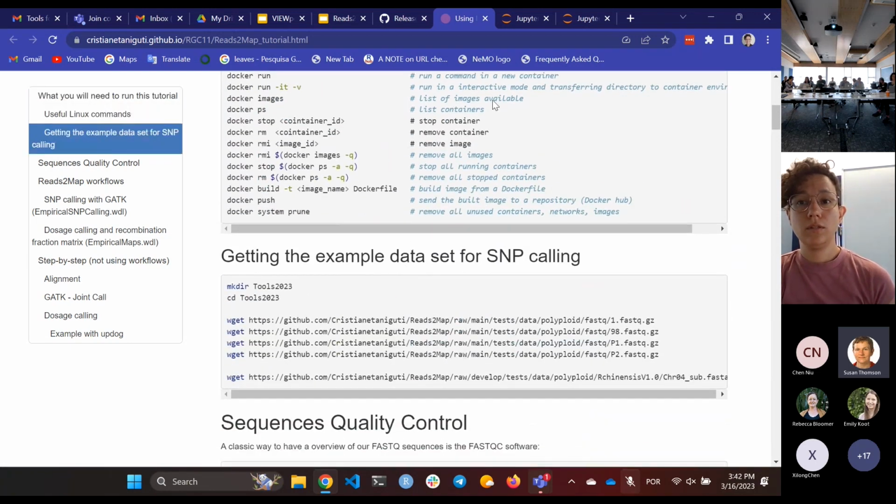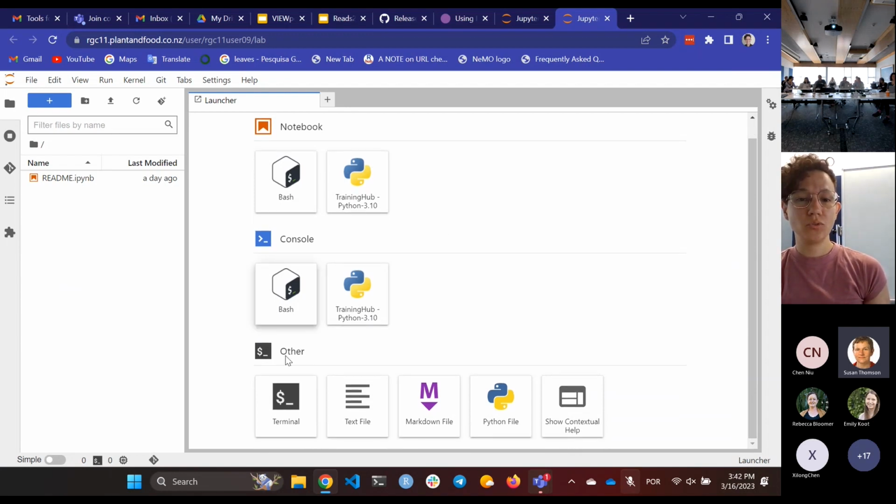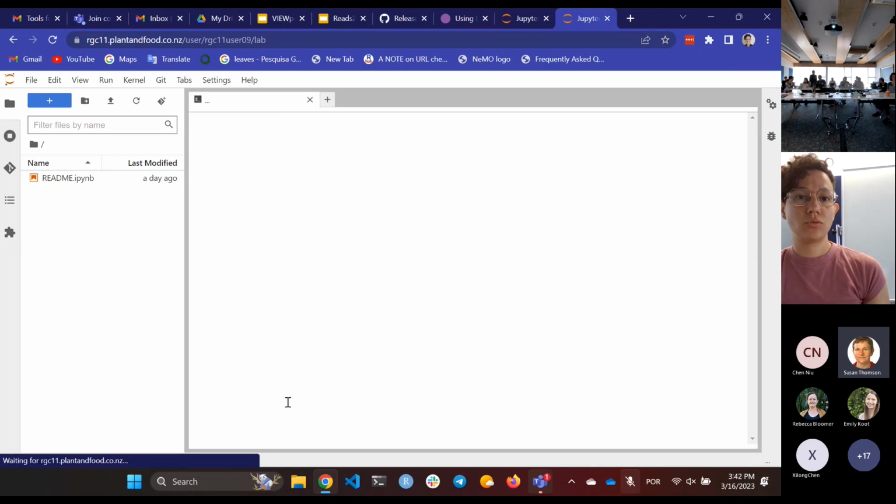Okay. And then you probably have access to the server. Everybody's following? Yes. We will use a terminal, so just open the terminal.